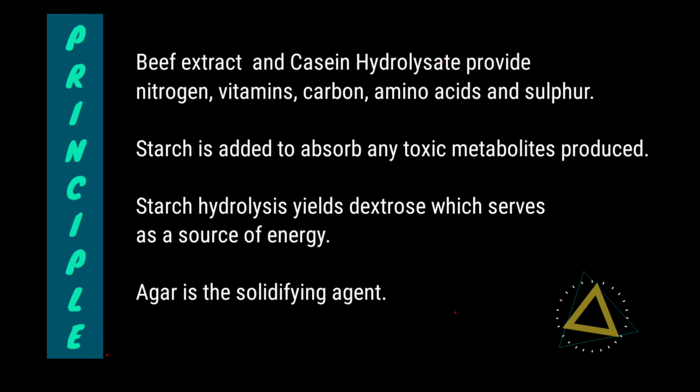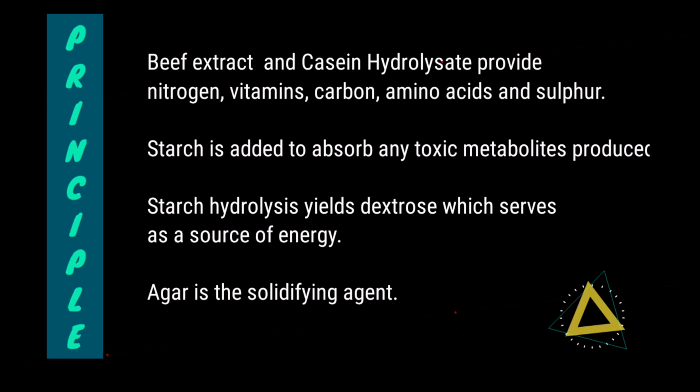So beef extract and casein hydrolysate provide nutrients, while starch is added to absorb any toxic metabolites produced. So yung toxic metabolites na pwedeng maka-apekto later on sa antibiotics na ilalagay natin, na-absorb ng starch. Starch hydrolysis yields dextrose, which serves as a source of energy. Then agar serves as the solidifying reagent.